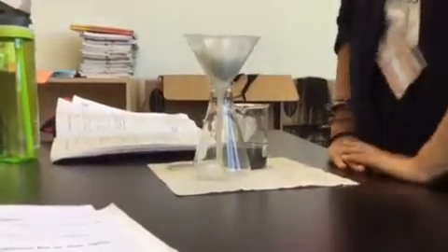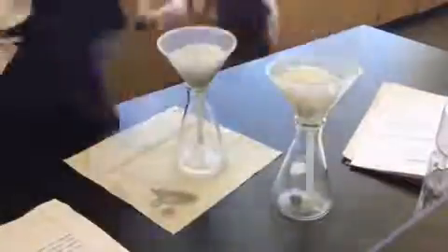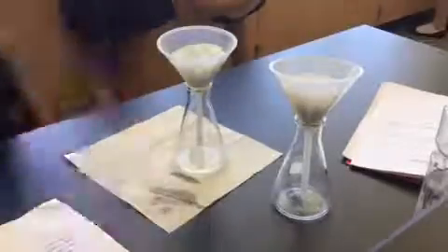After being filtered, we were left with the filtrate, which was the water and the dissolved salt, and the residue, which was the sand and the iron filings.